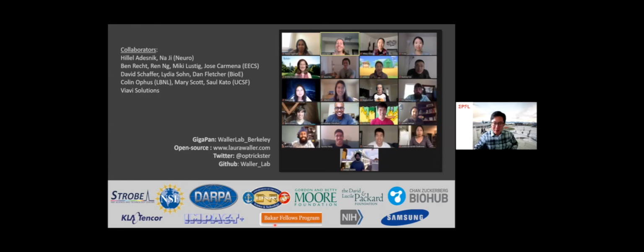Yeah. Hi Laura, thanks for this talk. There are questions that you have already answered, a bit like the optimization of the diffuser. But one question which is quite interesting is the one on adversarial attacks. Do you think adversarial attacks are possible in your methods as well? And how reliable, how robust are the techniques? I'm not sure I understood that question. Adversarial attack is if you change a little bit the camera image to completely change the reconstruction. Like a small change in the camera image will change a lot the reconstructed object.